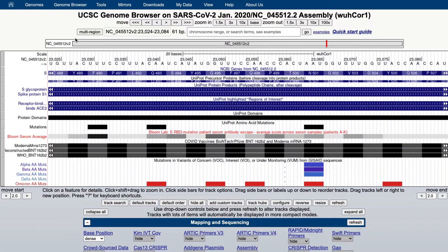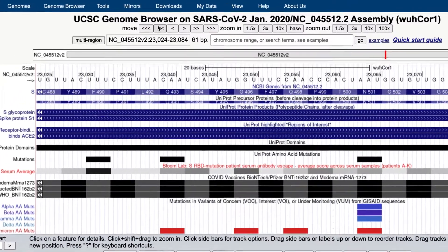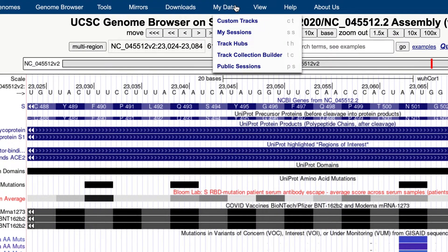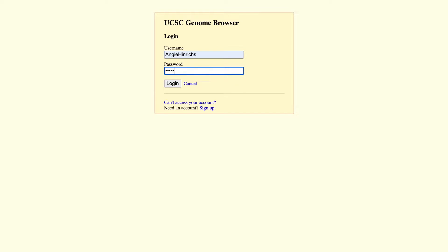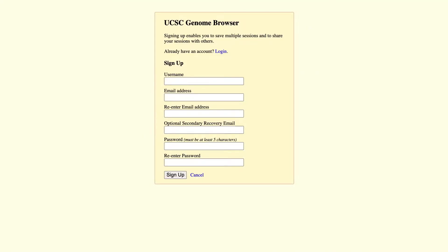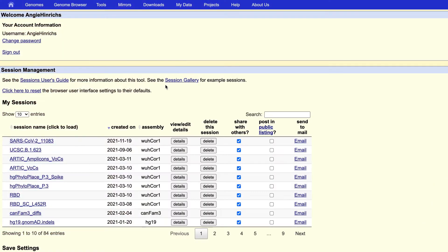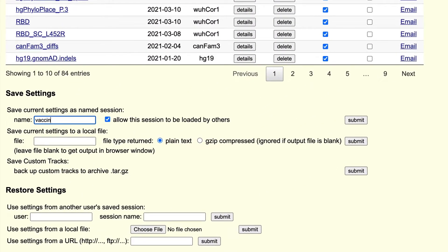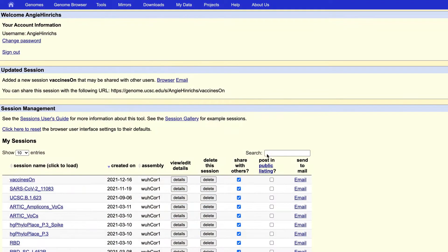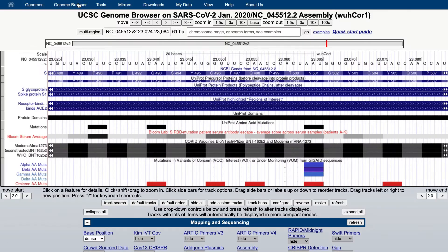To save the exact view you have configured, or bookmark it so that you can see it or share it later, you can store a snapshot as a saved session. To save your current view, navigate to My Data, then to My Sessions. Sign in or create an account. Scroll down that page to save current settings as a named session and give the session a name. You also have the option to keep a session private. Copy the session link and paste it to share. When someone follows the link, they will see the genome browser exactly as you have set it up. They can then change settings and navigate around without changing your saved session.